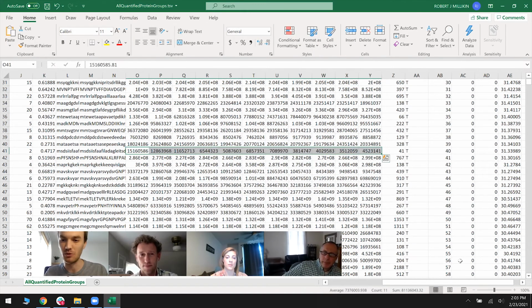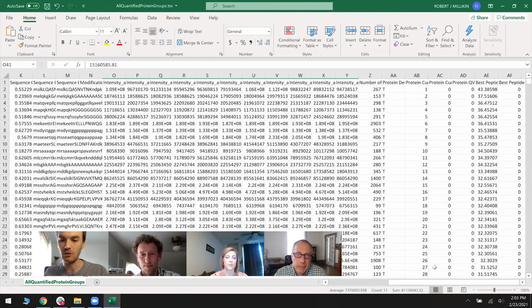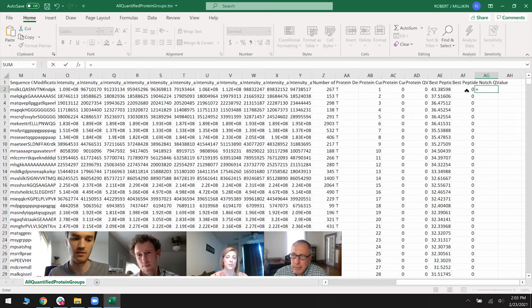And there's obviously some noise in between. So typically what you are looking for in a quantitative LFQ context is what's called a fold change, so how much a protein changes between samples. That's because this is a relative quantification. It's really not an absolute quantification.